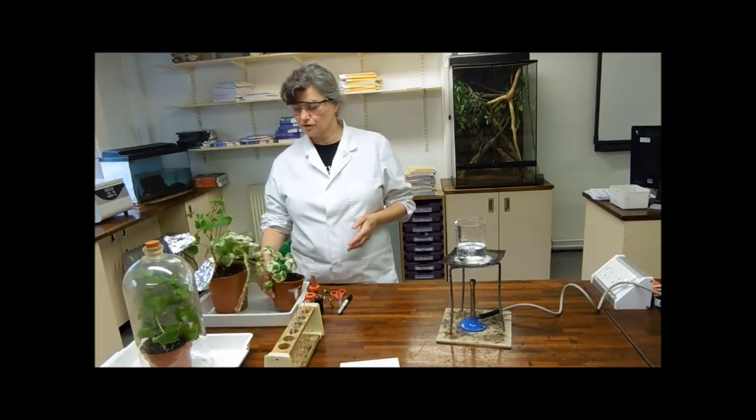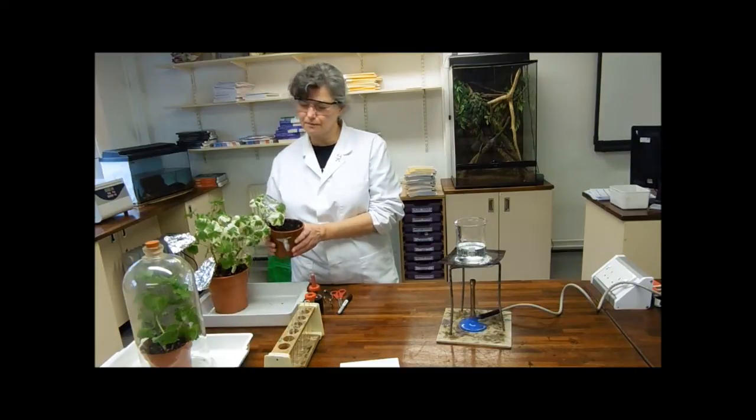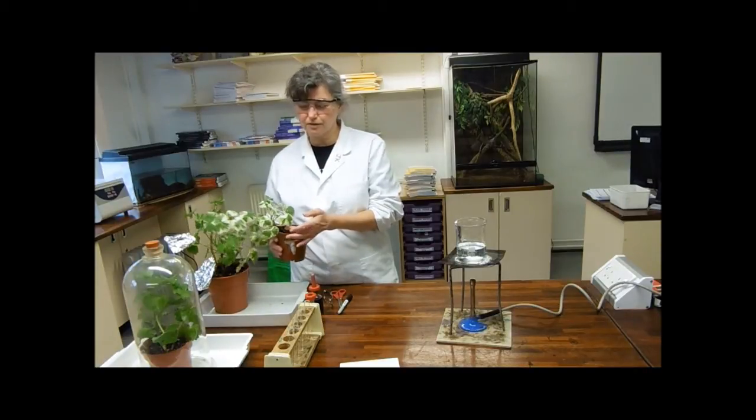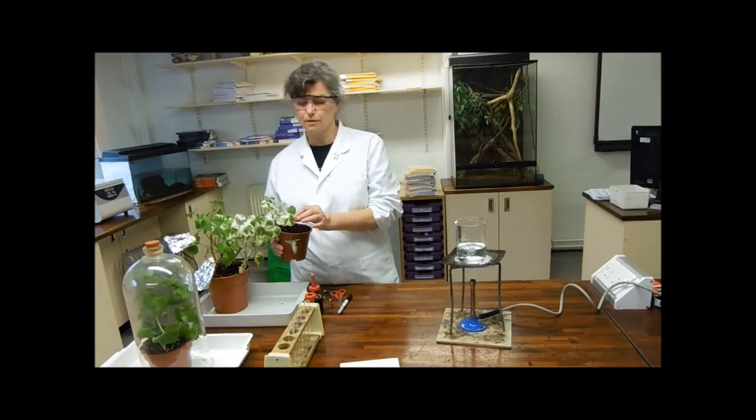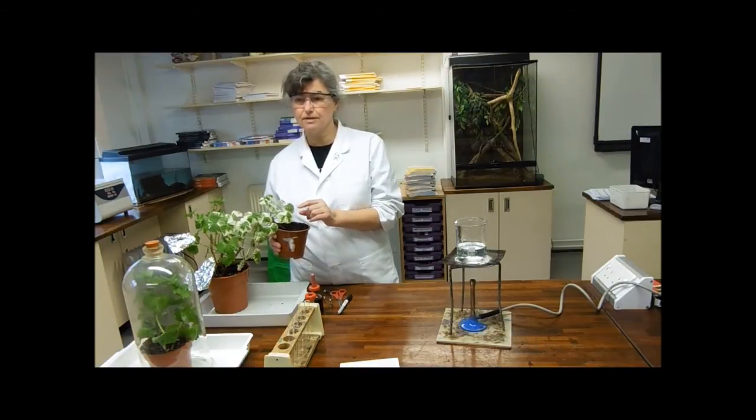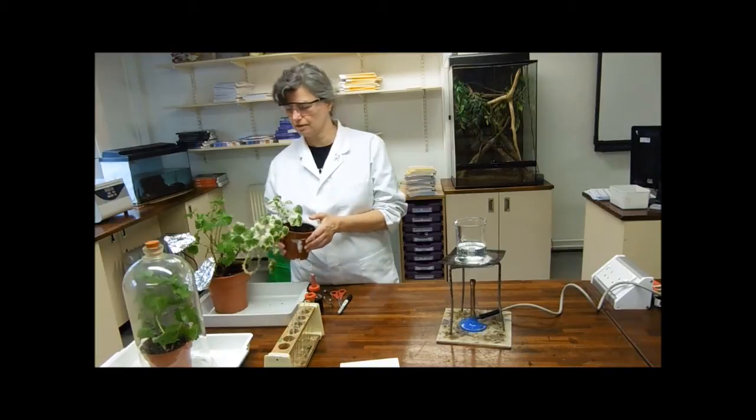I've got a variegated plant and for those who are unfamiliar with the word variegated, that means that part of the leaf is white and part of the leaf is green with chlorophyll. We're going to test to see where the photosynthesis is going on. If it's only going on where the green bit is, we know that we need chlorophyll.